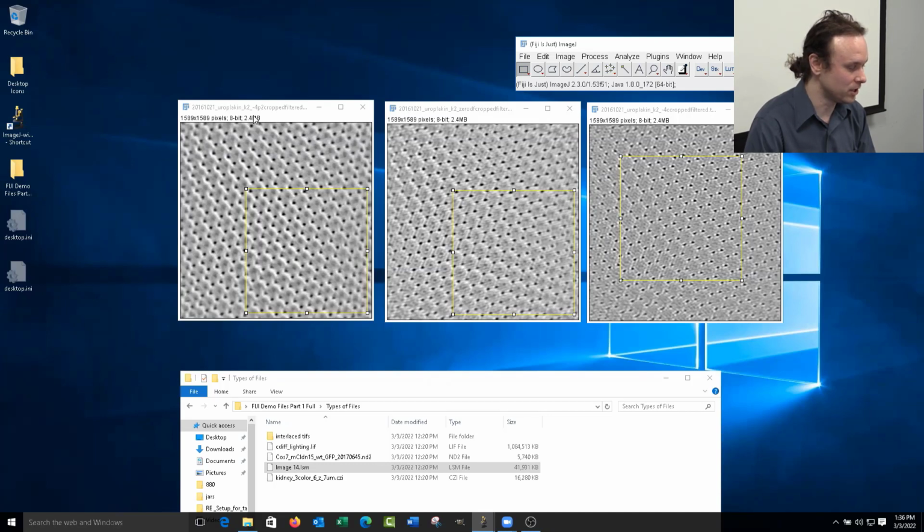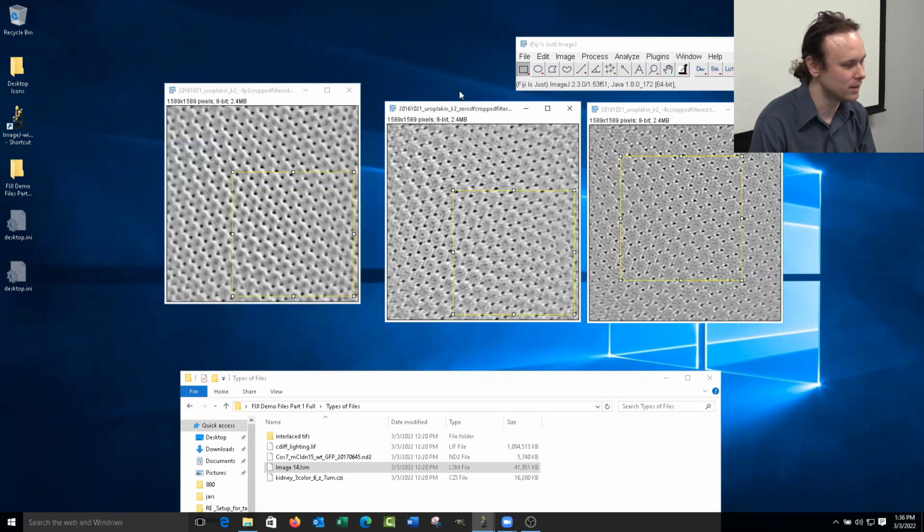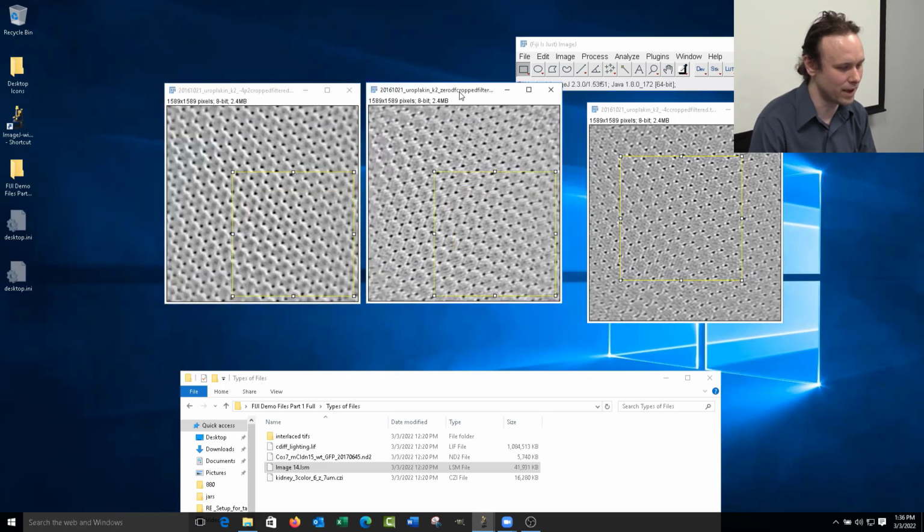For confocal imaging, you want to make sure you're at least within the 300 dots per inch, if not 600. It depends a lot on where you're submitting and all of that kind of detail. And we'll probably cover that in the future, I think.